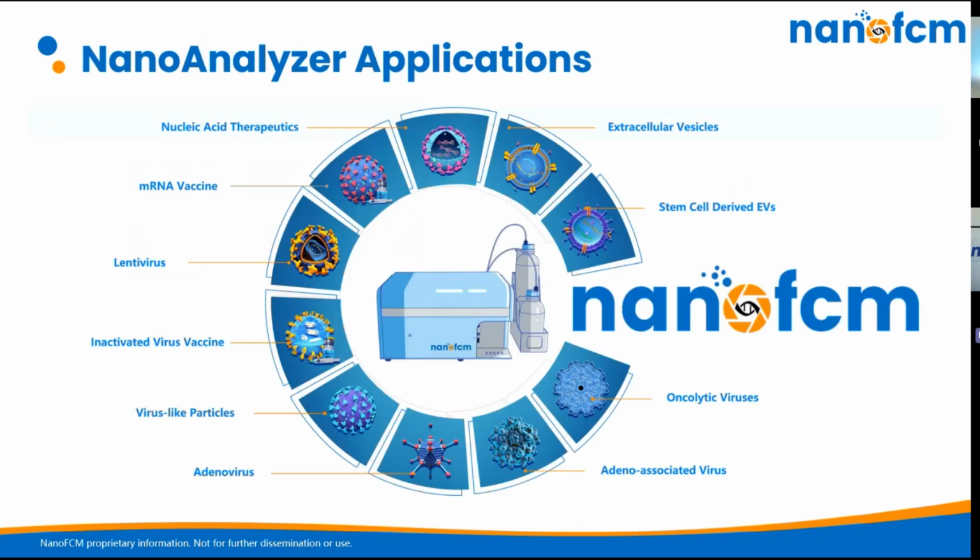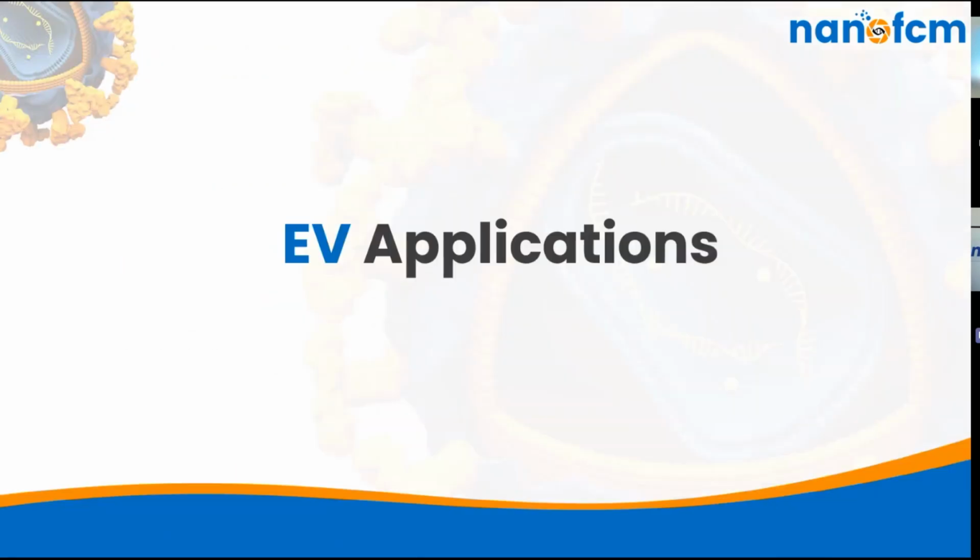This has been used for a wide variety of applications so far. Most popularly, we work with a lot of extracellular vesicle samples and lipid nanoparticles or other non-viral nucleic acid delivery systems. We also have some work with lentiviruses, all of which I'll discuss soon. I'll start with extracellular vesicles purely because this is what forms the bulk of our applications so far and the biggest portion of our experience.